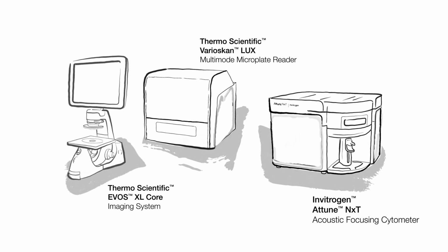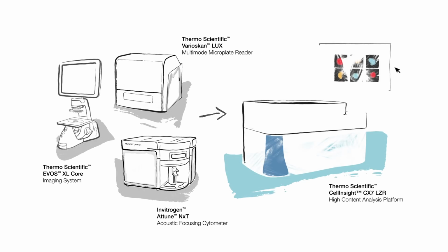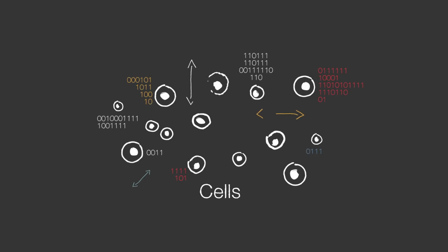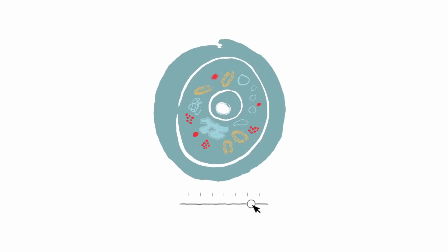Typically, if you have experience working on a microscope, plate reader, or a flow cytometer, then high-content analysis platforms and software will come pretty naturally to you. High-content tools differ from these technologies due to their image processing algorithms. These algorithms are like instructions and rules that measure phenotypic changes among cells.